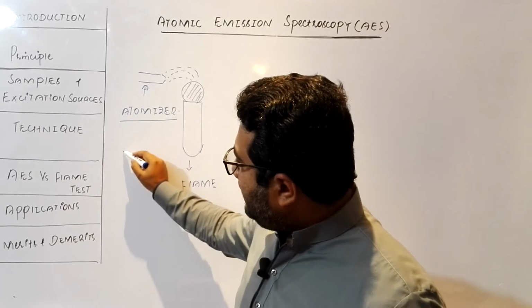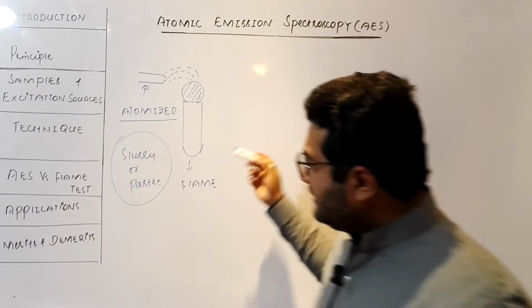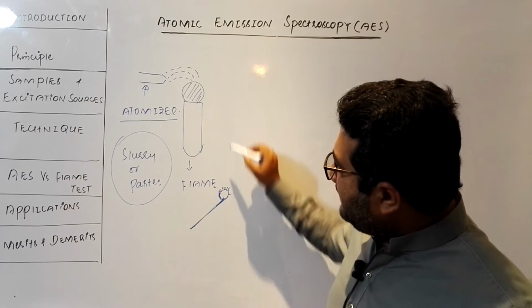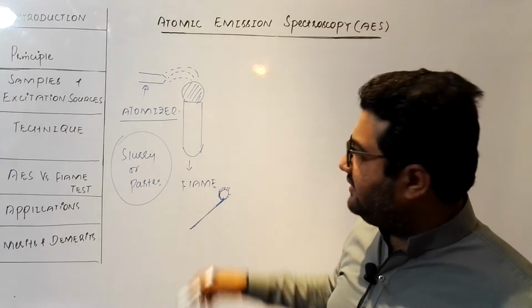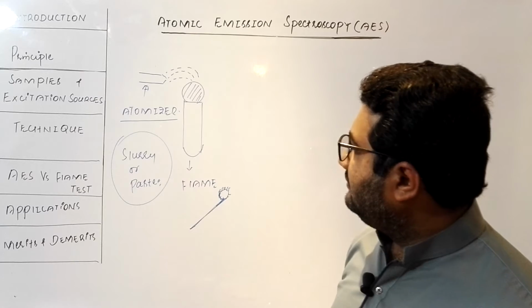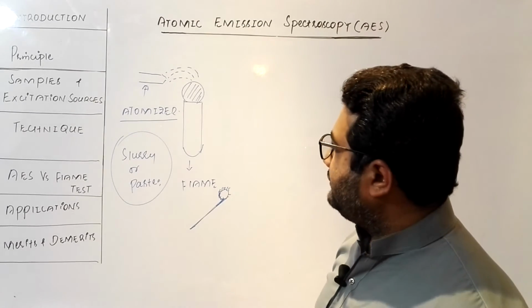But if your sample is slurry or paste of a solid substance, then we can use a platinum wire having a loop at its end, and here that slurry or paste is introduced, and this loop is placed on the flame, and flame causes the excitation. So this is a way to introduce your sample to the flame. Even you can use the discharge tube, that we have studied, how the discharge tube works. But I am here focusing on the flame atomic emission spectroscopy.